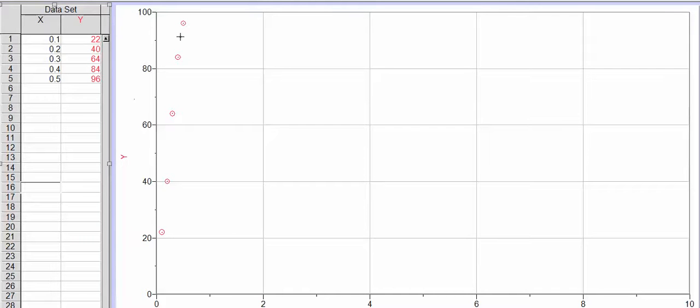This video is going to give you a few pointers on producing graphs with LoggerPro. Basically this is going to cover the basics of just getting your graph looking like it should, getting it in shape, and doing all that kind of stuff. It does not cover the actual use of LoggerPro devices themselves.